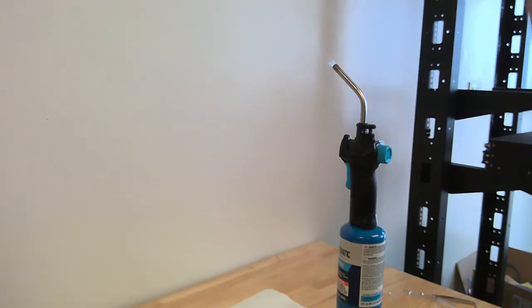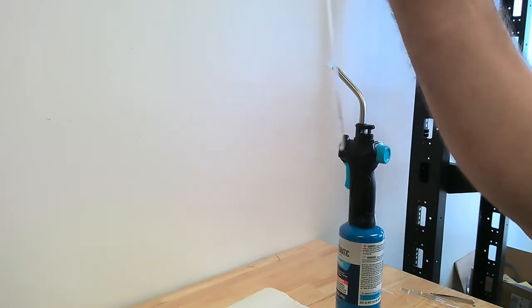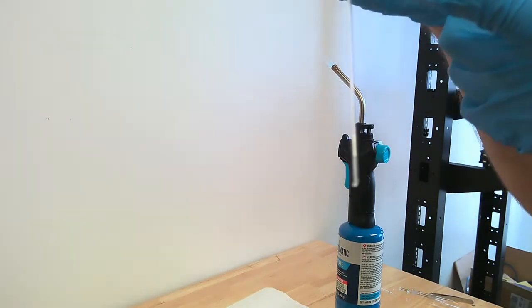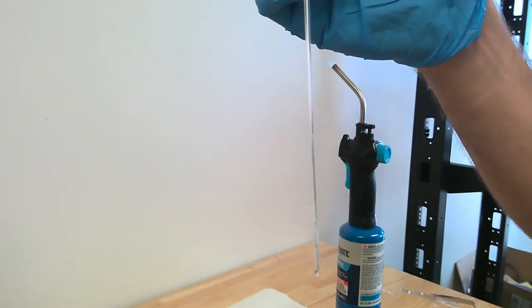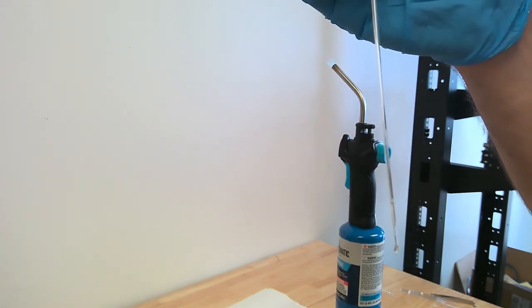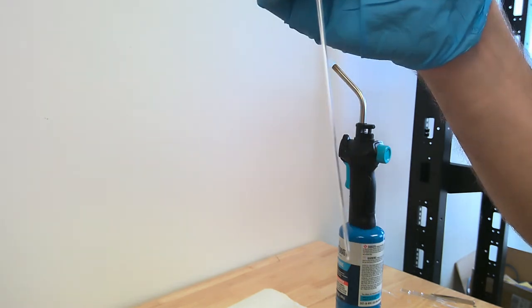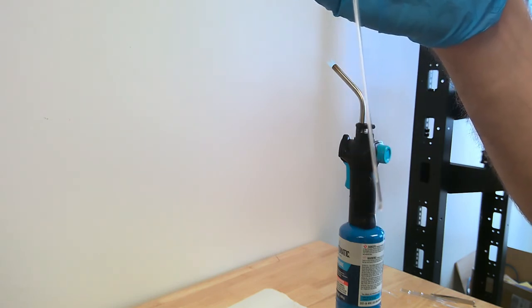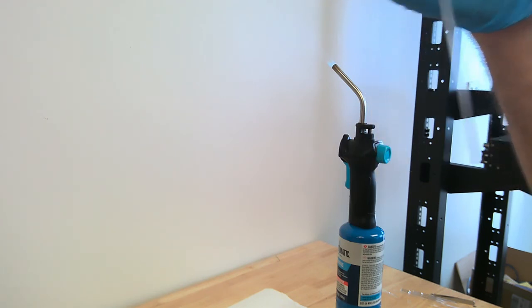So now that we've taken our sealed off melting point tube and loaded it with a sample solid, in this case a paper clip, we're going to seal the top end of our melting point tube, assuming that the opening of our pipette was hooked up to vacuum. I don't have a vacuum line currently, but the main way to check that you have a perfect seal is if you apply vacuum and the solid does not move, you're good to go. We're then going to seal off under vacuum the top end of our melting point capillary, and that will give us an evacuated melting point capillary tube.